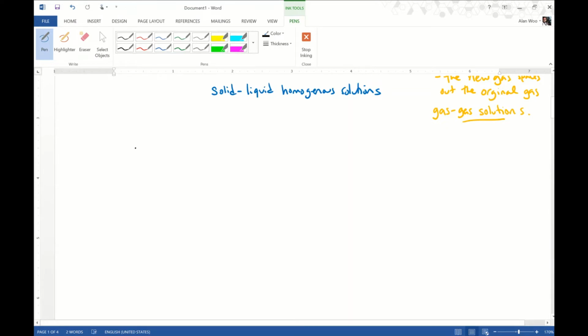Okay, the one that I want to start with first. So we'll just say that these are special dilution techniques. I think in the notes package I might have written it as advanced dilution techniques, but there's a couple here.